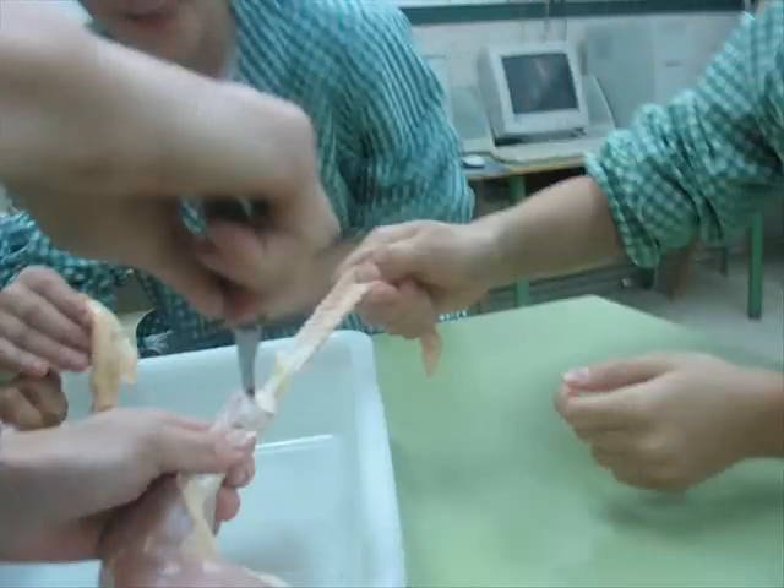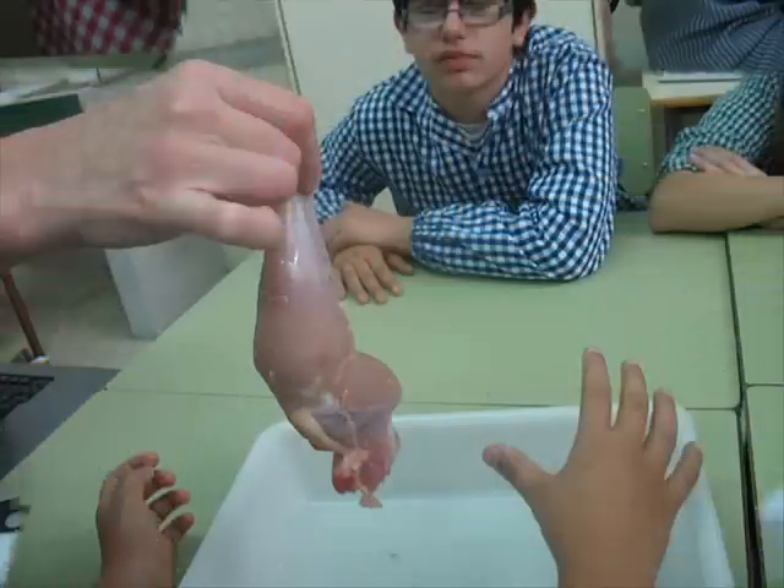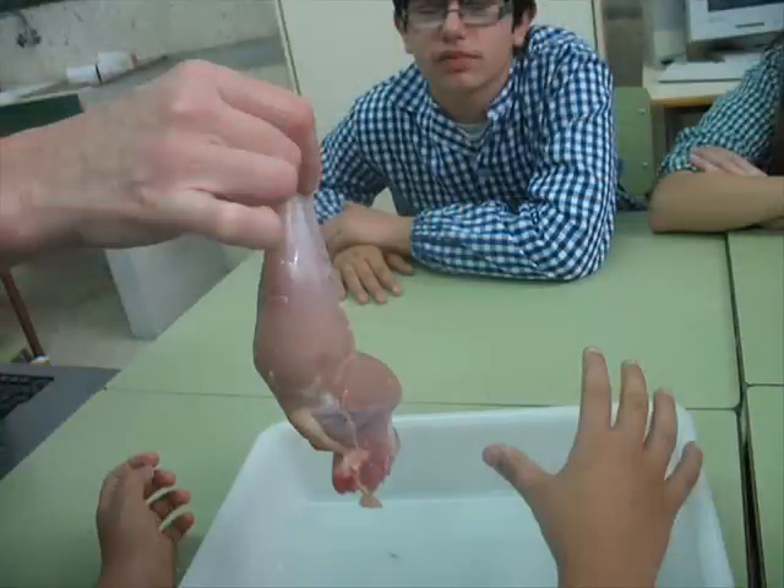Take out the skin and start dissecting the chicken leg. Take the stretch of the bones and the joint movement. Pick up the chicken leg and observe the muscles' movement and function.